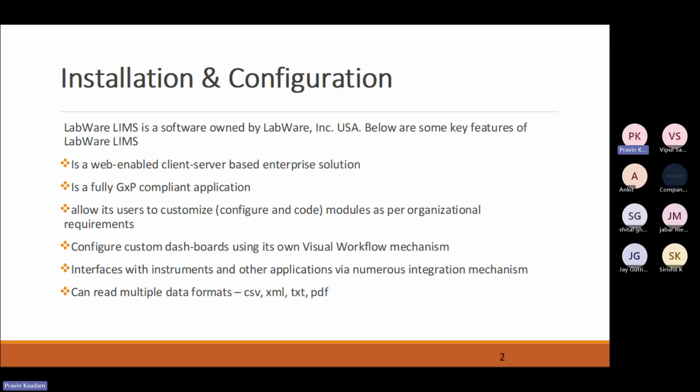A little background about Labware LIMS. Labware LIMS is owned by Labware Incorporation USA. It's a US based product, widely used not only in USA but across the world, especially Europe and India.